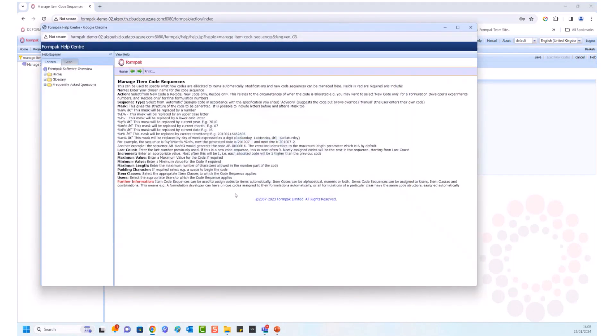You can set it up for specific users or all users, and choose new code and recode. You can set it to automatic so it automatically generates an item code, or set it to manual. There's also a mask option — the help button explains the structure of how the mask is set up. There's also a support article on managing item code sequences. We'll set it to automatic and click Save.